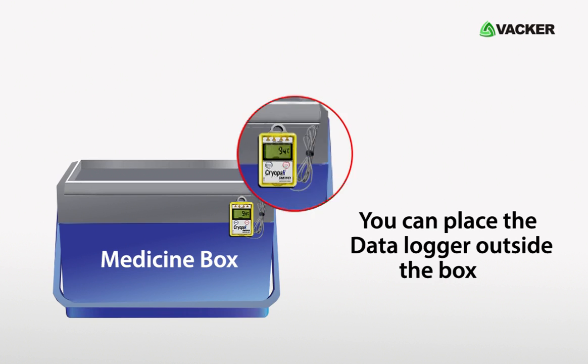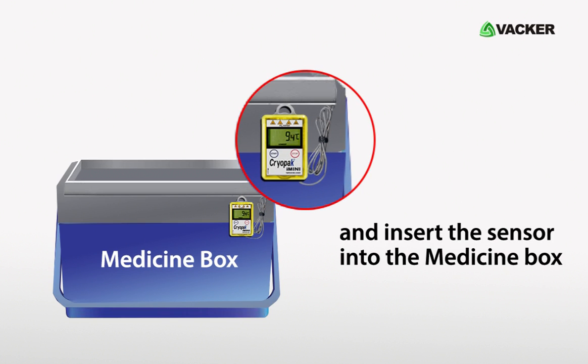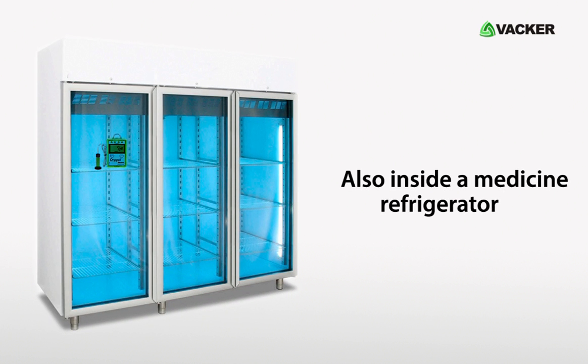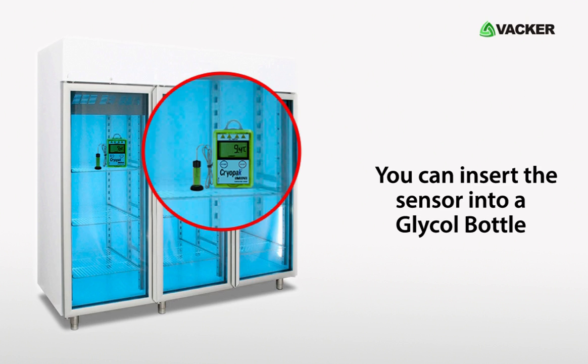You can place the data logger outside the box and insert the sensor into the medicine box. Also, inside a medicine refrigerator, you can insert the sensor into a glycol bottle.